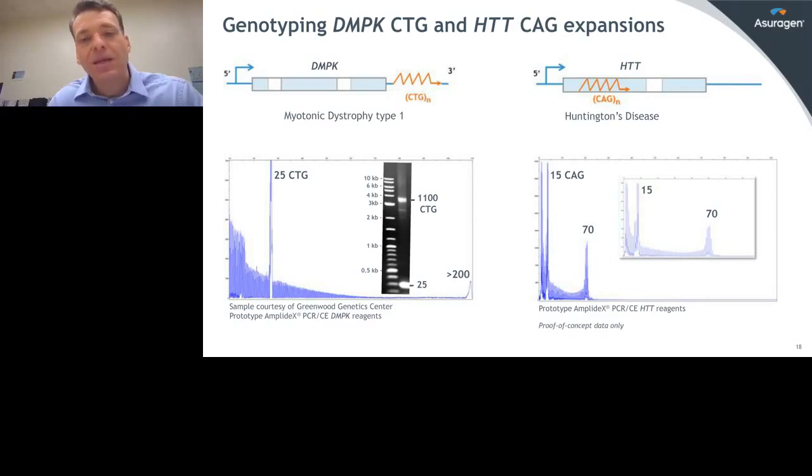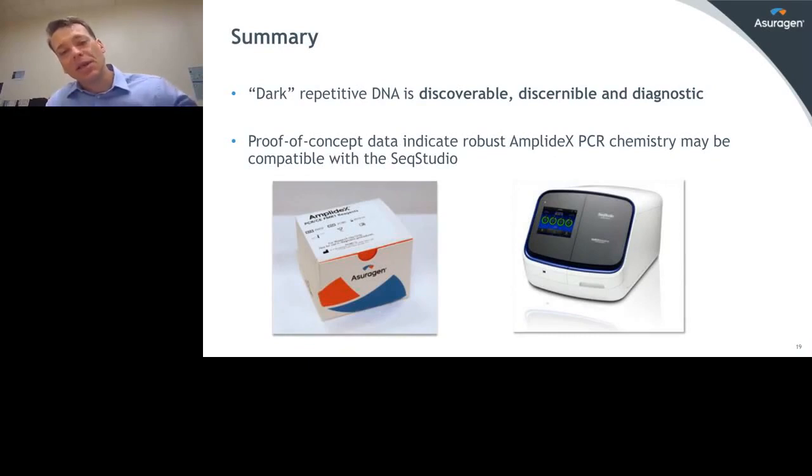And then the last case is with Huntington's disease. This is at HTT, in the exon, it's a CAG. The clinical threshold for disease is around 40 repeats, and I'm showing an example here of a 15 70. We have no trouble picking up the 70. In fact, we've run up to 250 with this particular repeat expansion and been able to detect it just fine. So both of these show that the SeqStudio has the potential to accommodate these numbers of repeats.